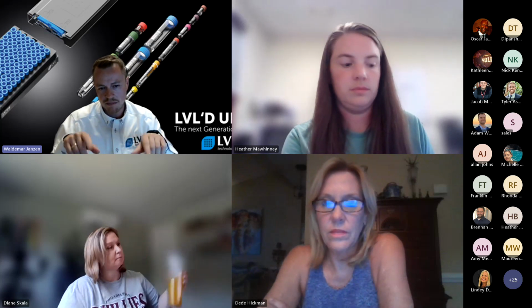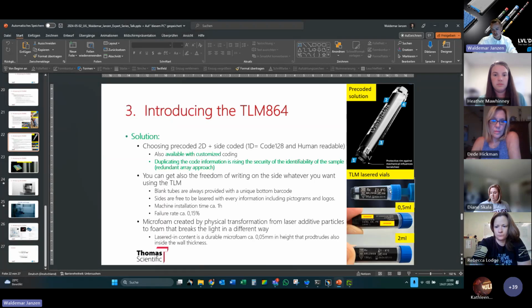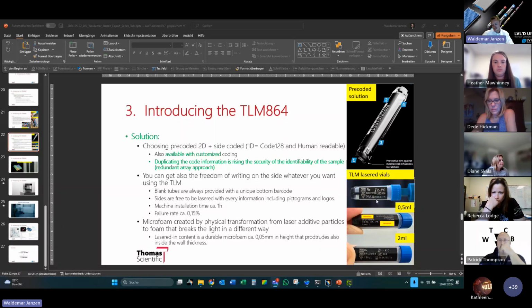The limitation upon how much information and how many objects you can put on the tube depends on the size of the black patch that you have. So if you check out this picture over here, it's arranged just the way you would arrange it on a paper label or using PowerPoint. So you're not limited. The limitation would be the area of the black patch and the font height that you would still find good for being readable. Theoretically, you could squeeze it down to get multiple lines, but the question is then how comfortable do you feel still reading it?